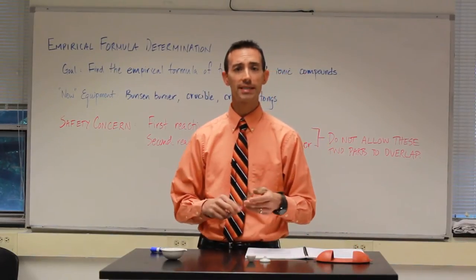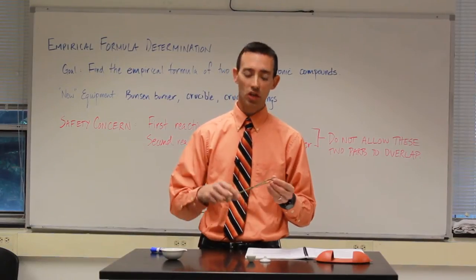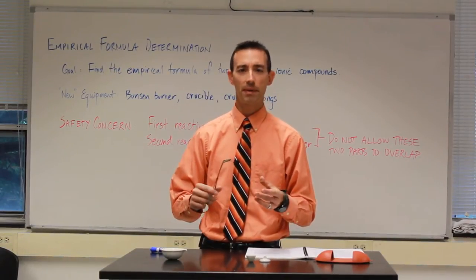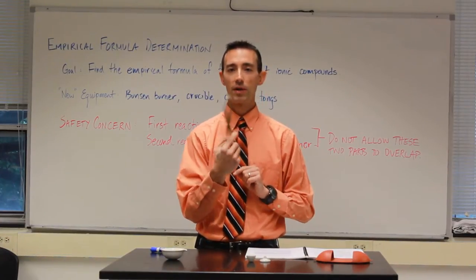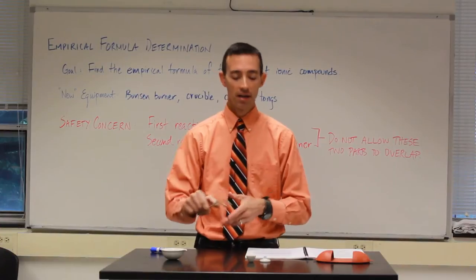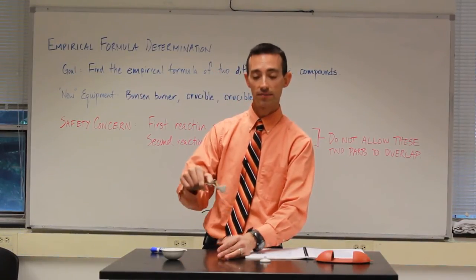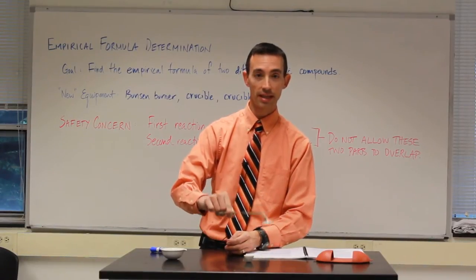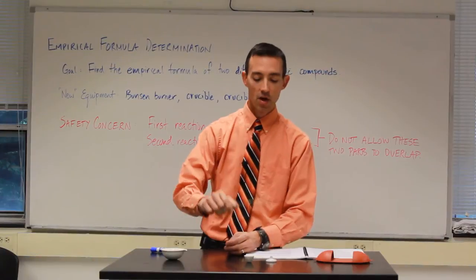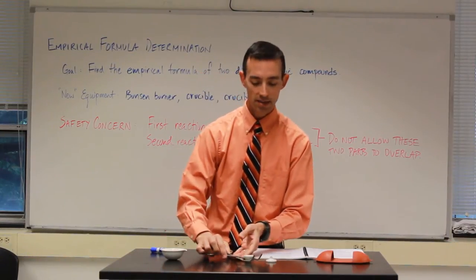There are a couple of ways to handle the crucible with the crucible tongs. The crucible tongs look on the one hand like any old pair of tongs, but they do have this opening in the middle here, which comes in handy for our work today. We can grab the crucible two different ways, by its edge, as you see me do right here. We can also use the tongs to pinch the lid of the crucible. Or you can lay open the crucible tongs and slightly pinch.